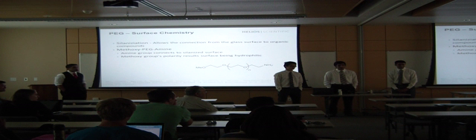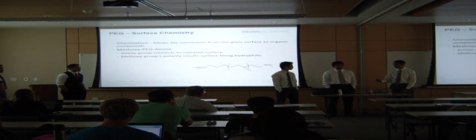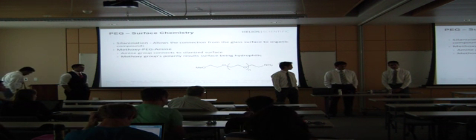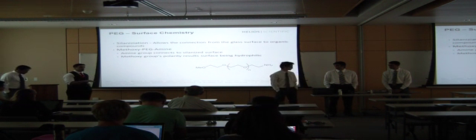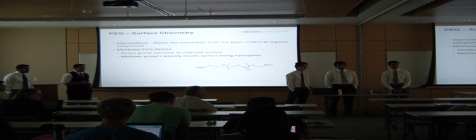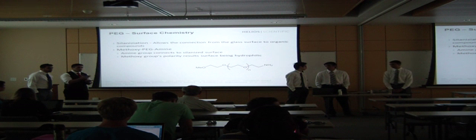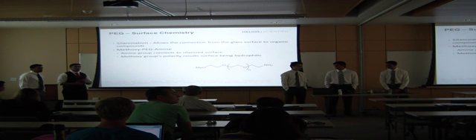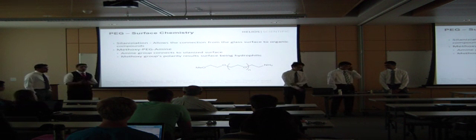What's the density of the PEG attached to the lens? Have you measured it? The way we test whether the PEG is on the surface is a contact angle test. We took our glass slides, measured at different corners, and took an average. If it was within range, we can assume that our PEG is on the slide based on those numbers, but we had no actual way of seeing what percentage.